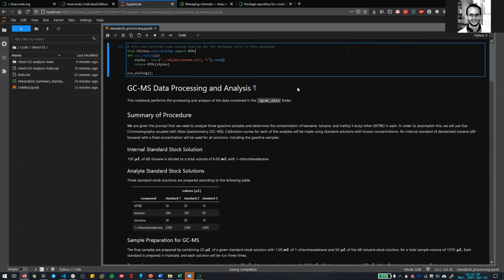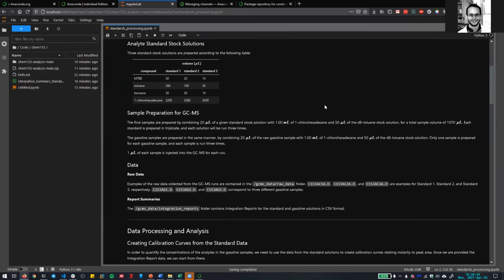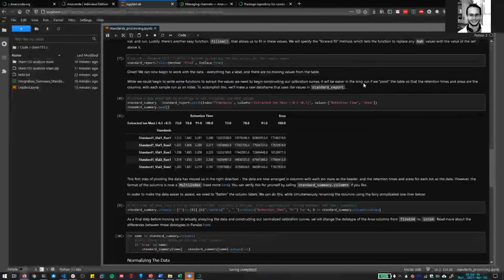I don't want to belabor the point too much or spend a lot of time here because we're going to go over it again on Wednesday, plus some extra stuff we'll code together. But yeah, does anybody have any questions or problems that they're running into before we wrap up for the day?